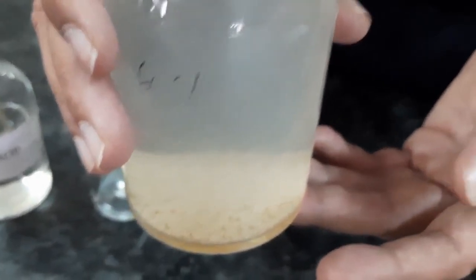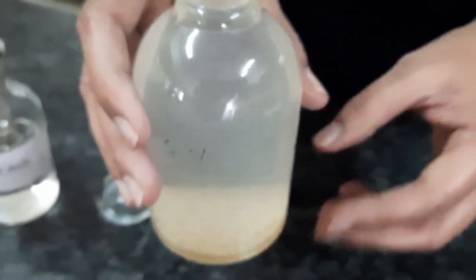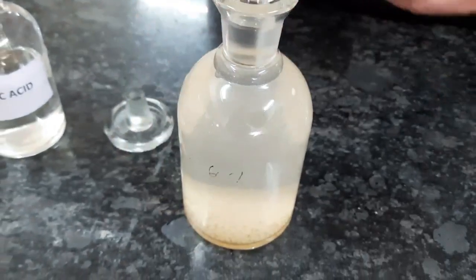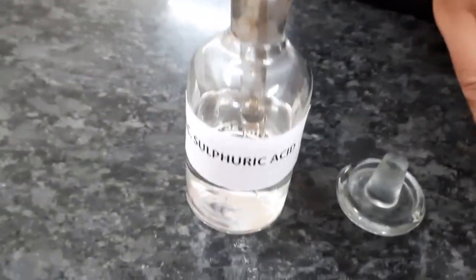It is the end of 20 minutes, and we are now adding H2SO4 to acidify the precipitate.